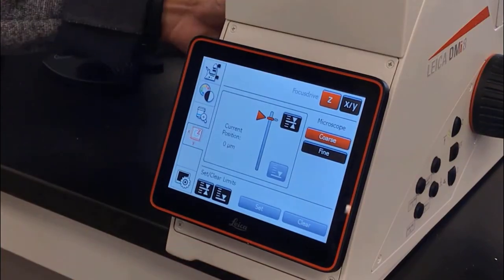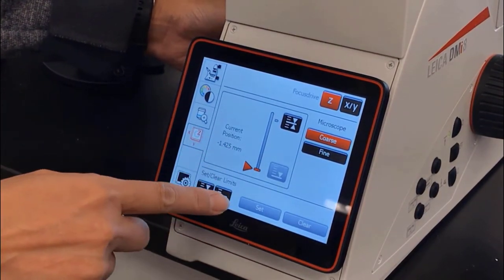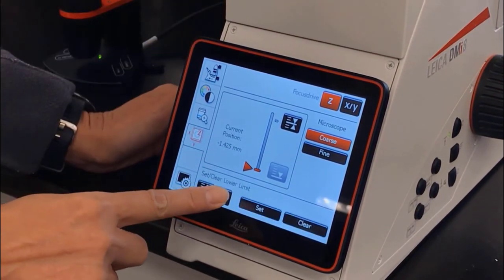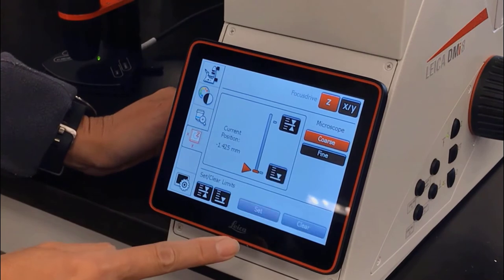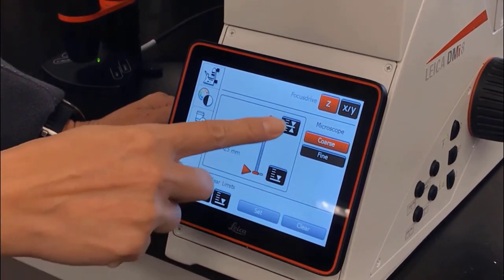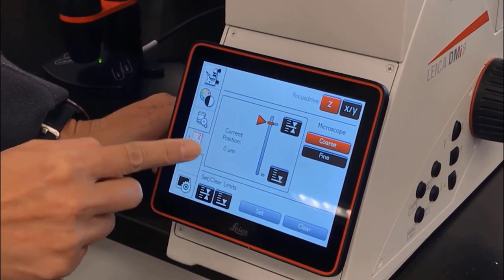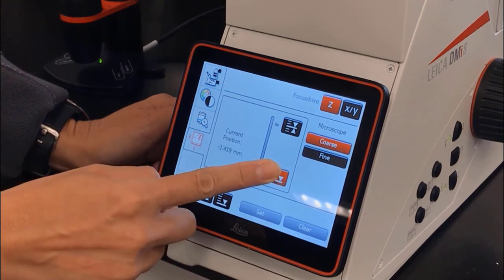You can also set a lower limit by lowering the focus, then hit lower limit and set. Now you can toggle between your focus position and lower limit.